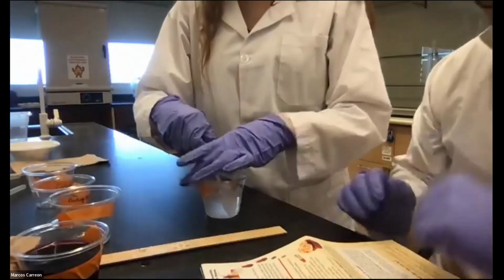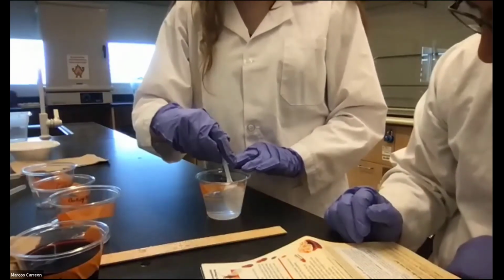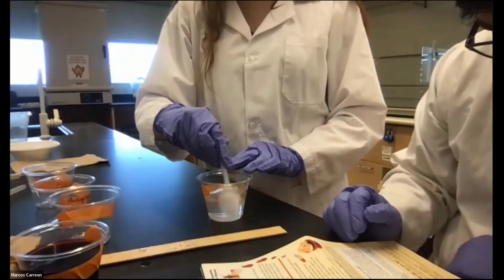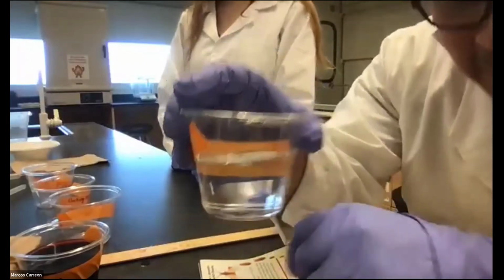Right now she's mixing that water with the baking soda. The solution beforehand was kind of cloudy, and now it's clear.